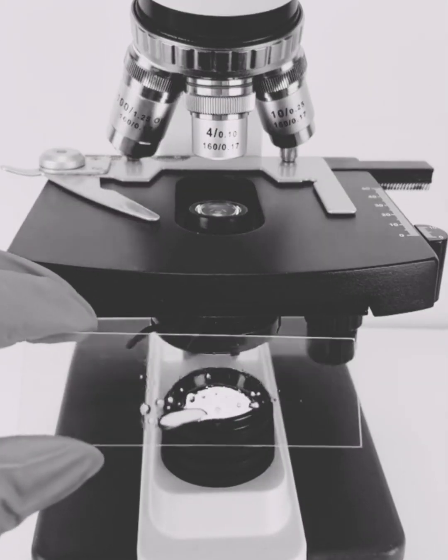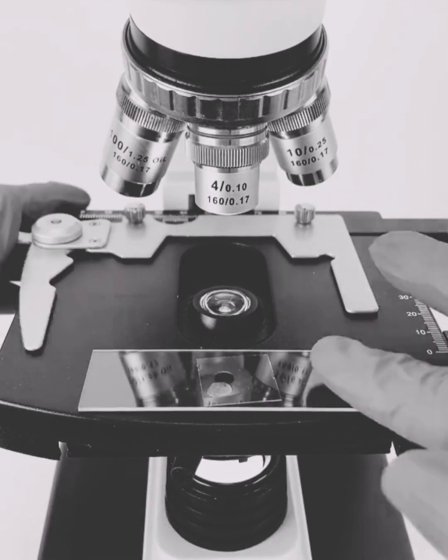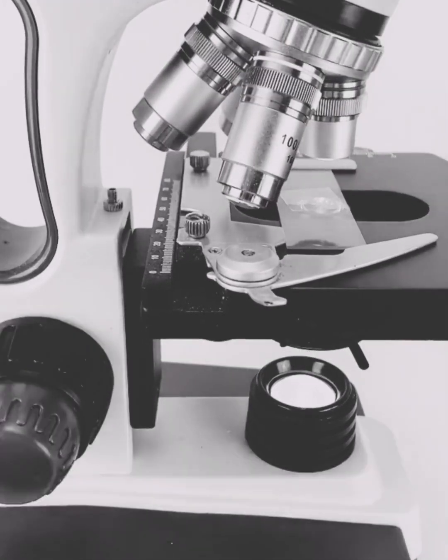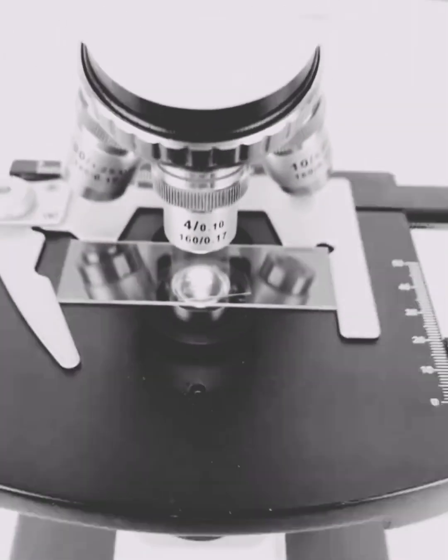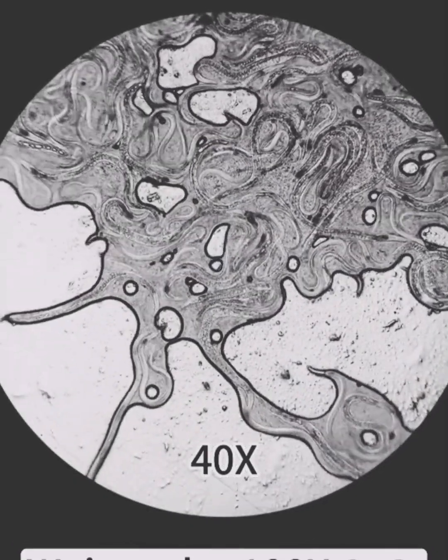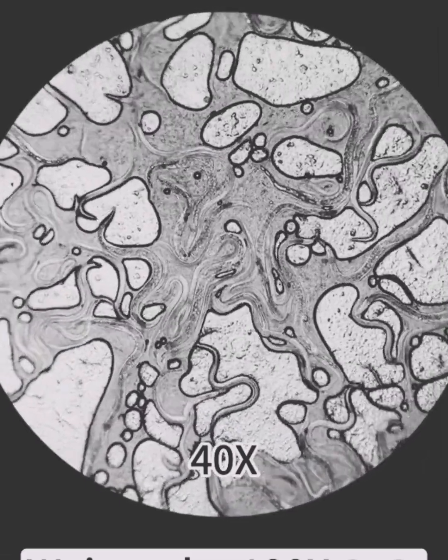In today's video, we are going to look at cat saliva under the microscope. So this is the cat saliva placed under the microscope. We're trying to look at how the saliva appears under the microscope. Under 40 times magnification, let's see what it reveals. These are the things we saw when we examined the cat saliva at 40 times view.